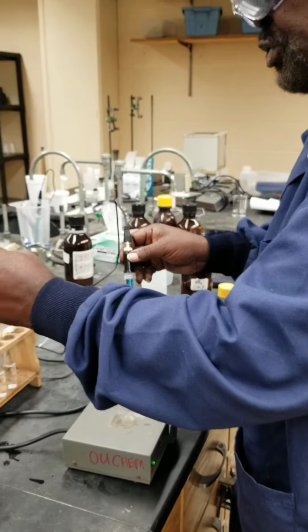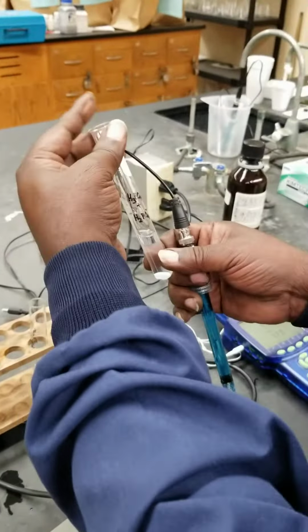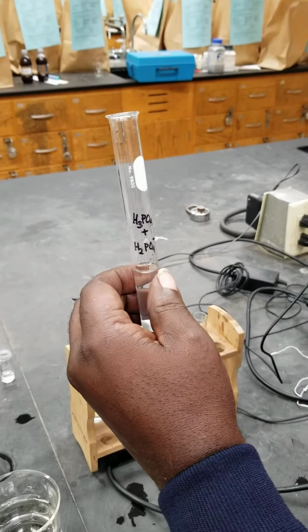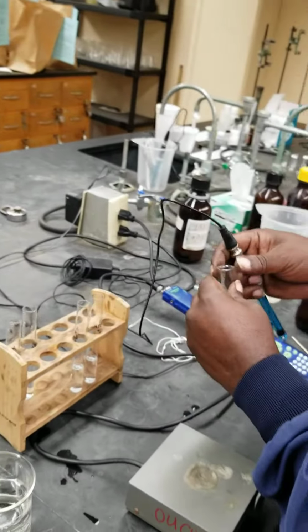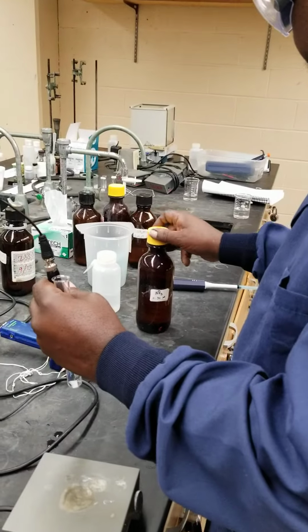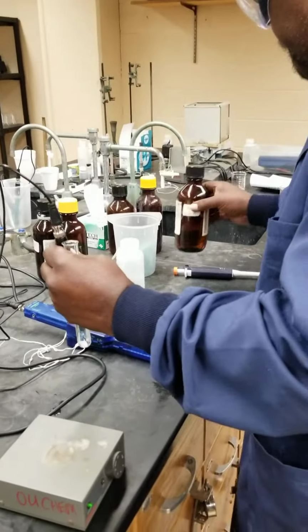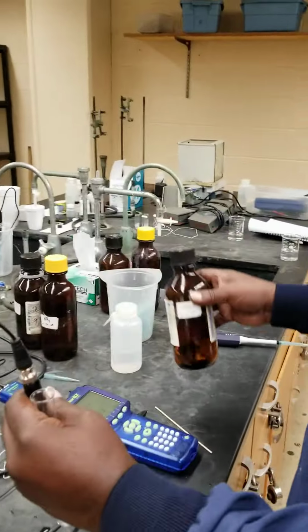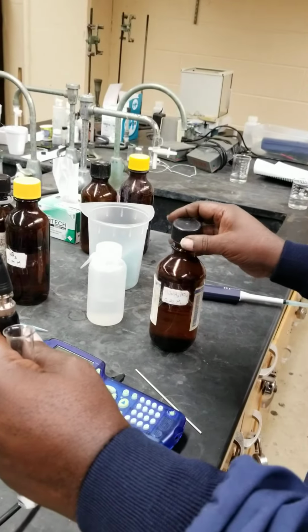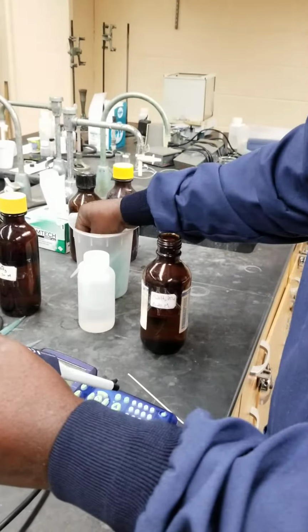Now moving on to the phosphoric acid, H3PO4, that's the acid. H2PO4 minus is the conjugate base. Move that out. Make sure I'm getting the right thing. All of these are 0.2 molar. Change the pipette tip.